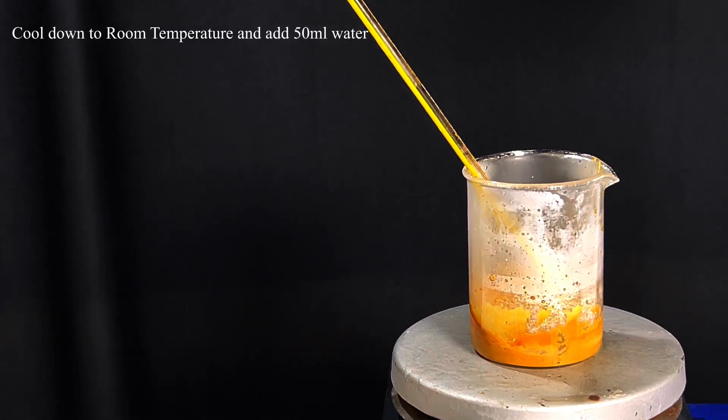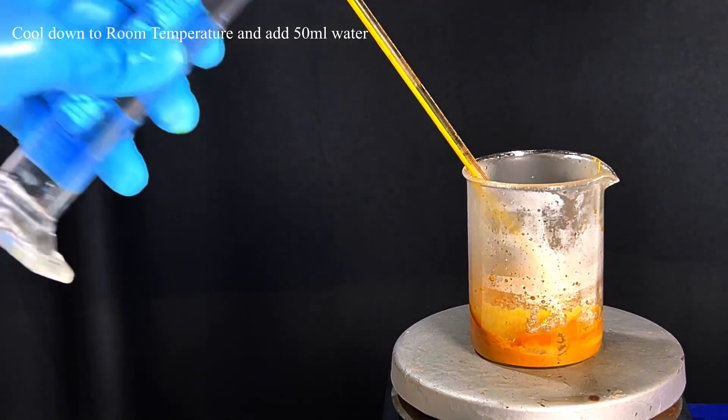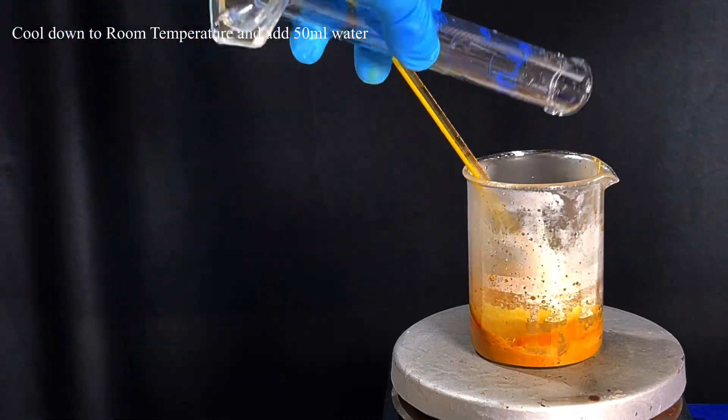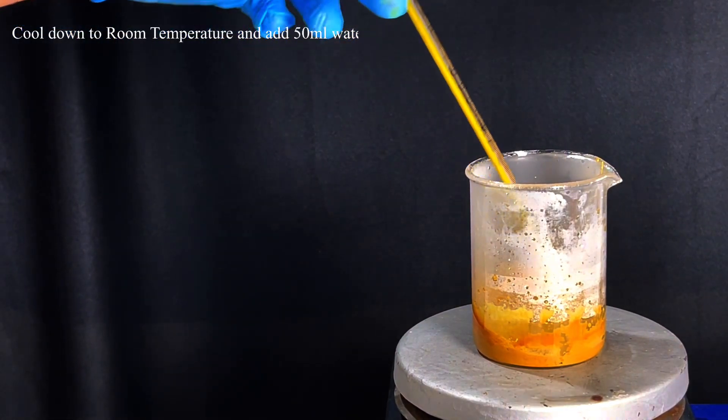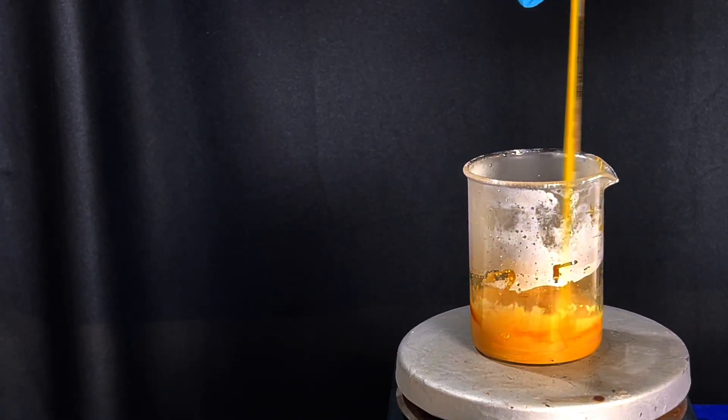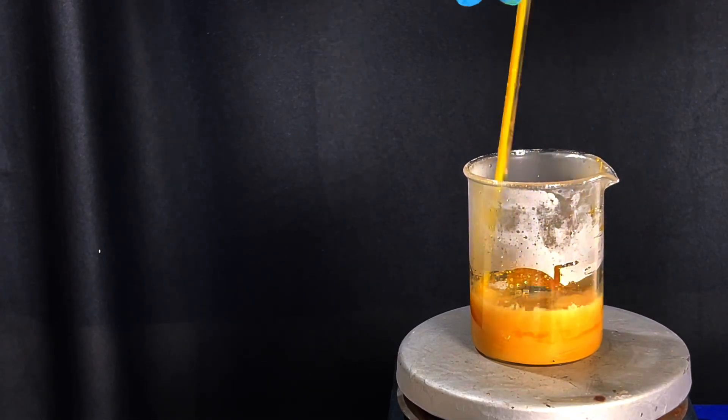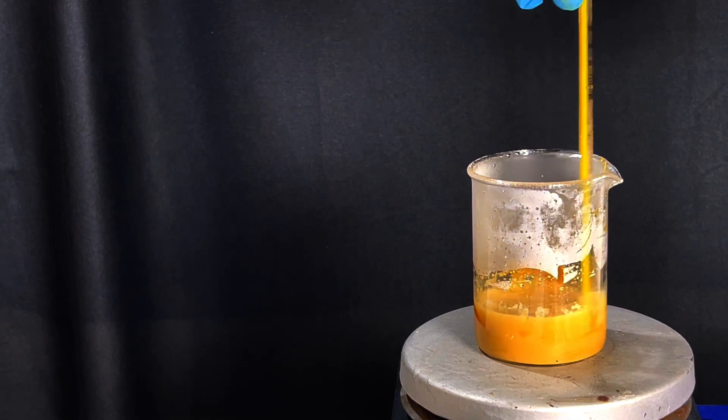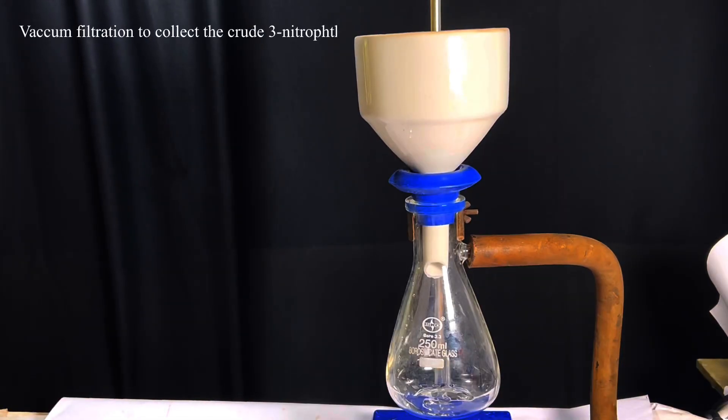After 10 minutes, it's cooled down to room temperature and then 50 milliliters of water was added to the beaker. This will help dissolve all the byproducts which are water-soluble and all the unreacted compounds. Our desired compound 3-nitrophthalhydrazide does not dissolve in water. Here you can see me desperately stirring with a thermometer. One shouldn't be using a thermometer as a stirring rod.